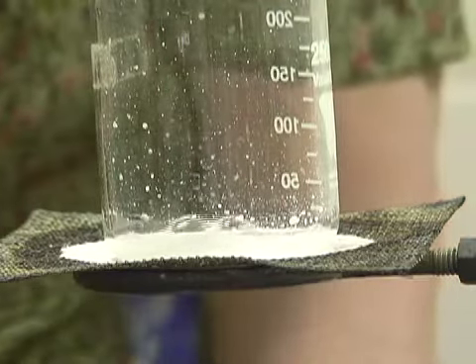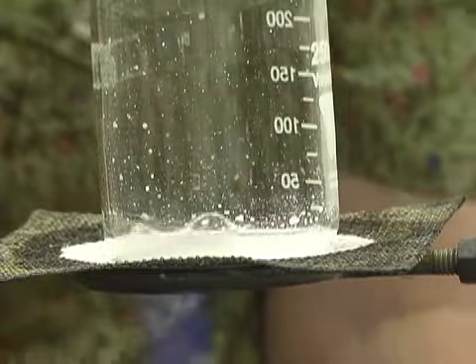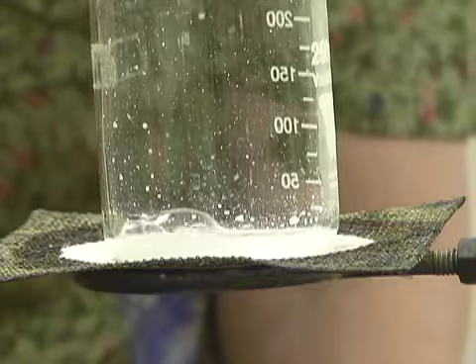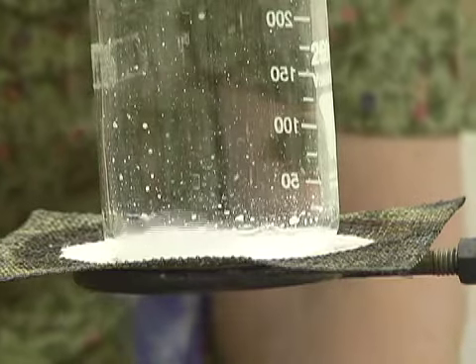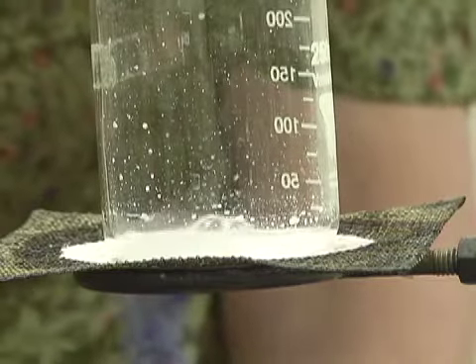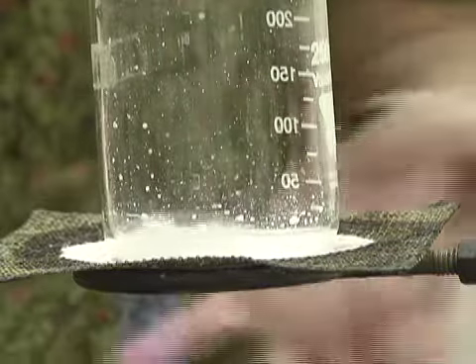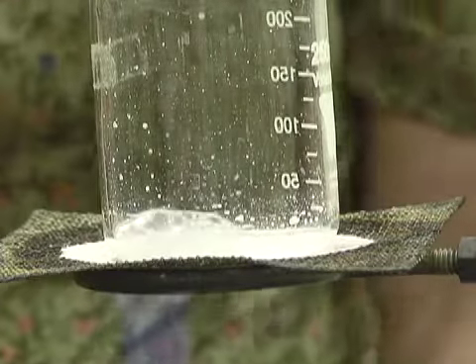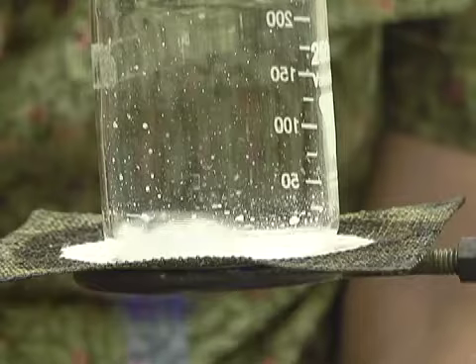Oh my, the crystal's on that side of the beaker. And then we just have to cool it because we cannot weigh things on the scale when they're warm. That damages the scale. And also, remember that hot air rises and it causes it to be buoyant and it causes my masses to be less. And I can see there's hardly any liquid left in there.